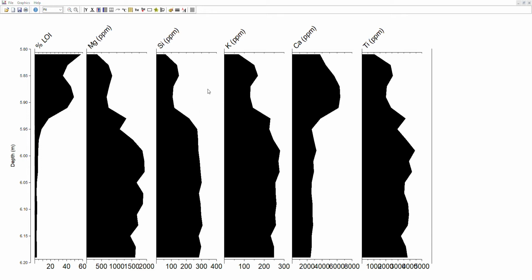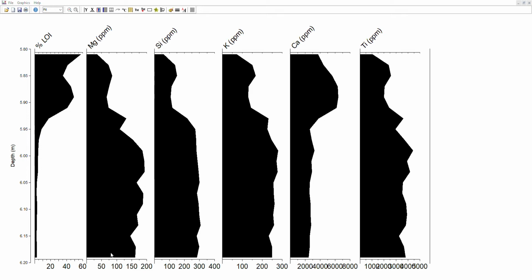We'll select another variable. Let's have a look at magnesium. So select magnesium, deselect silicon, have a look at the tick marks, and this time it's divided by 10. Now that looks a bit jumbled together. If I divide that by 100, I think that will make those a bit more legible. Everything will be a bit smarter. So if I click on apply, I can see that there. So that's divided by 100. The next one, let's deselect magnesium and have a look at potassium.